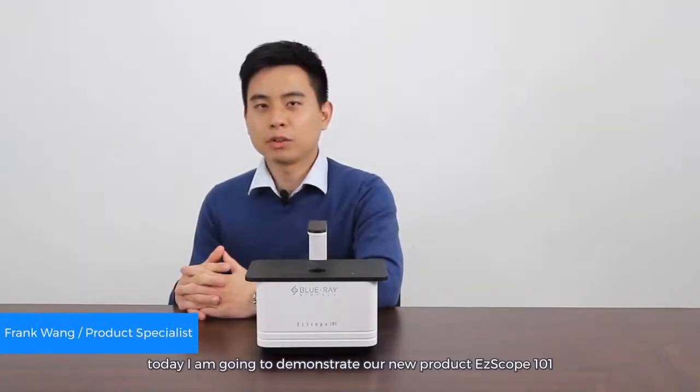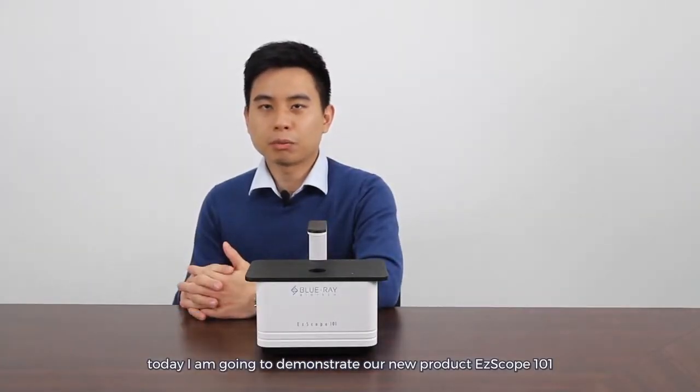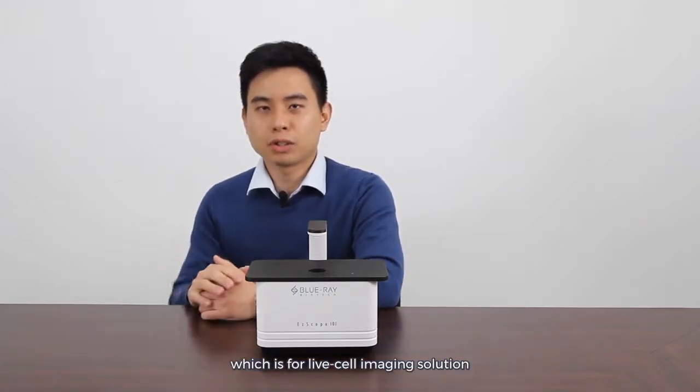Hi, I'm Frank. Today I'm going to demonstrate our new product, the EZscope 101, which is for live cell imaging solution.